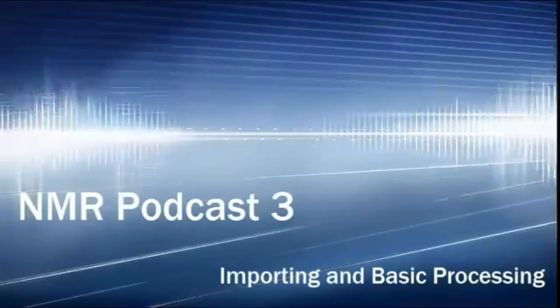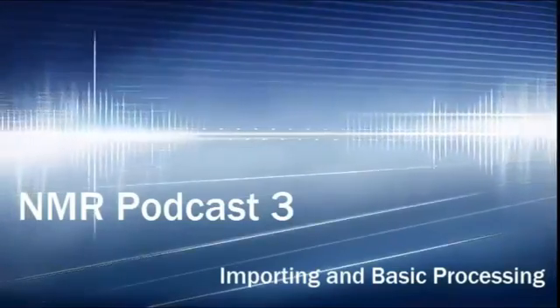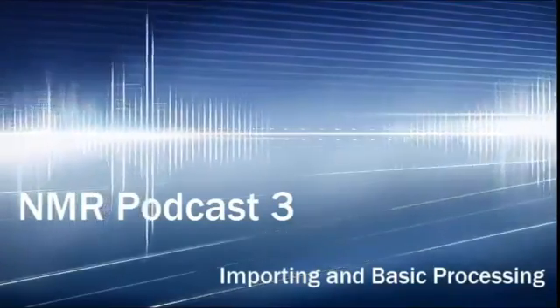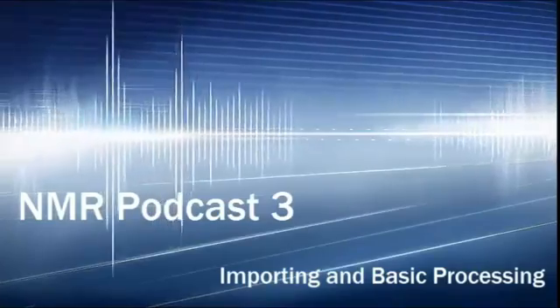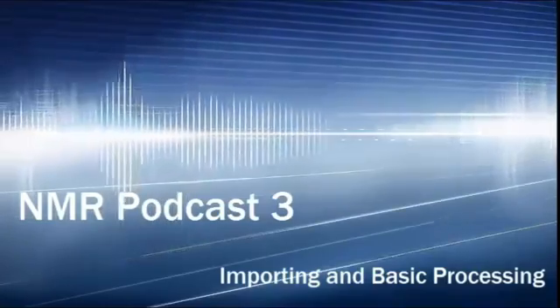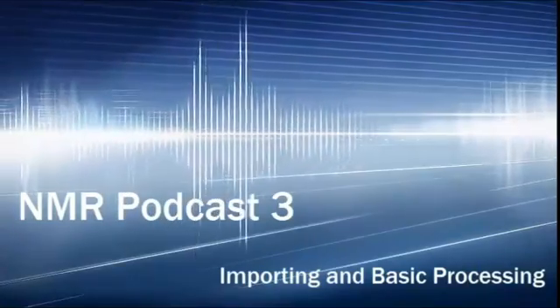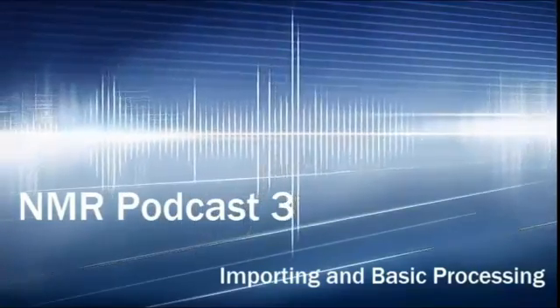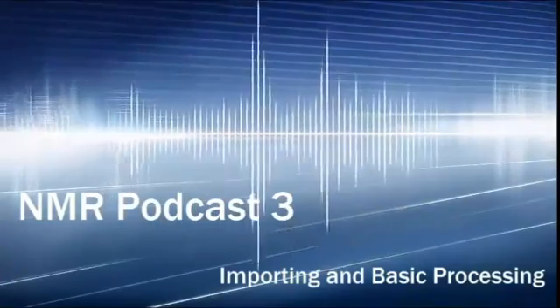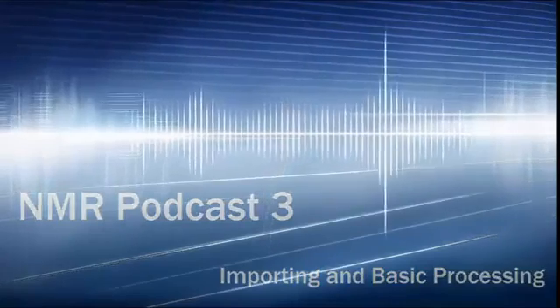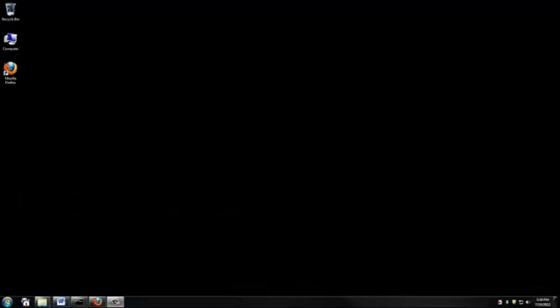Once the NMR has finished my experiments, I'm automatically going to receive an email that contains my data. This podcast is going to show you how to extract that data from your email and open it in Topspin, which is our NMR software. I'm also going to show you how to do basic processing of your spectrum.